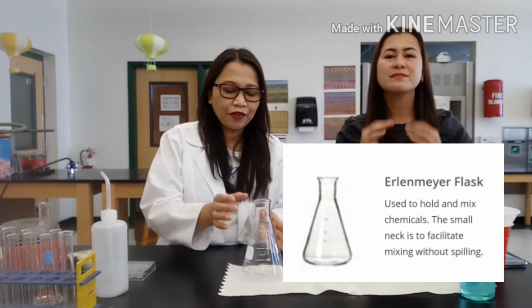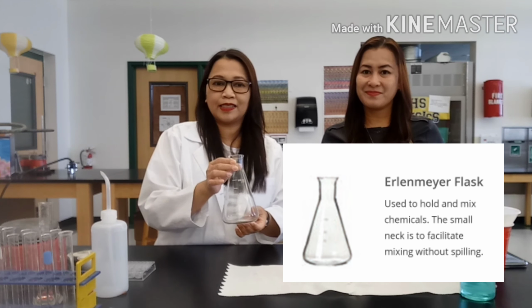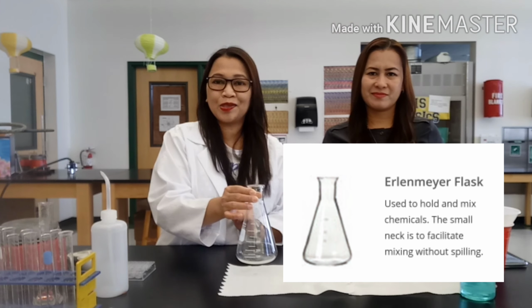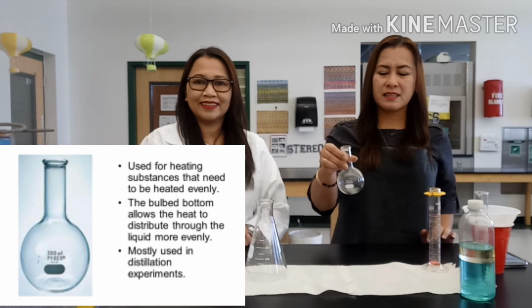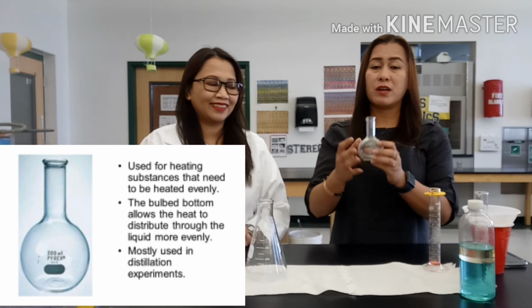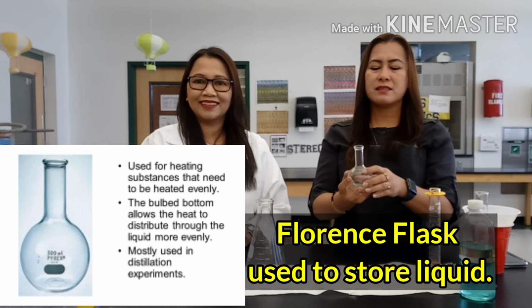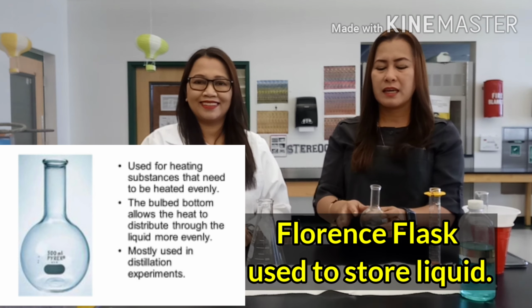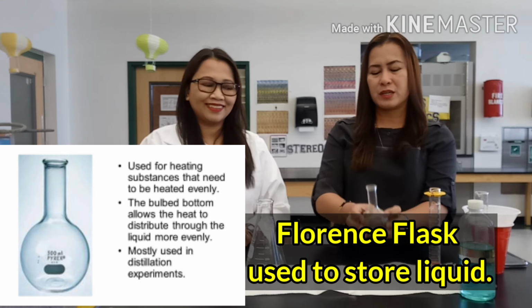All right, so this time we're going to have the Erlenmeyer flask. This is used to hold and mix chemicals. The small neck here is to facilitate mixing without spilling. Same as with the Florence flask, this is also used for storing liquids in smaller amounts. As you can see, it has a long neck. This is used for distillations and some other purposes. It's not used for measuring any volume of your liquid.